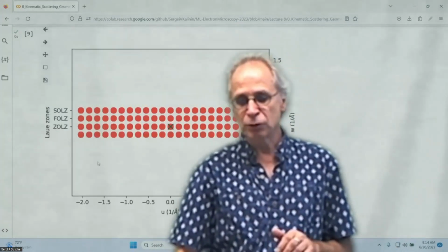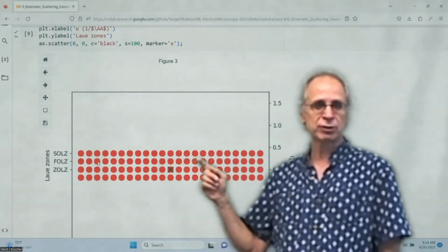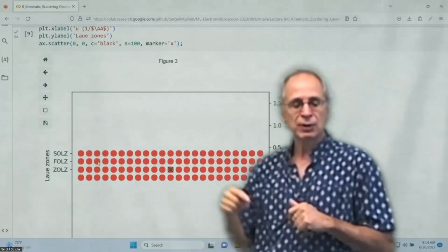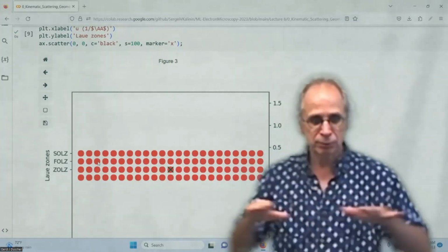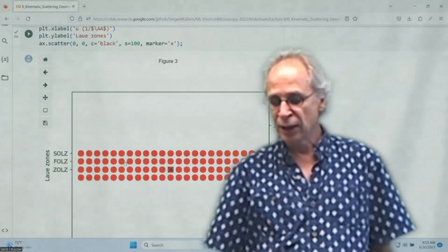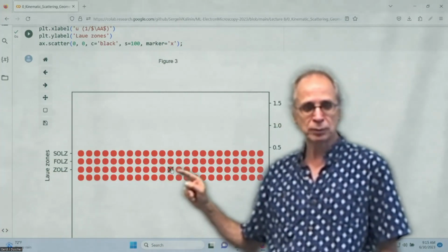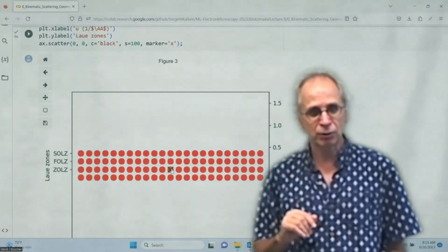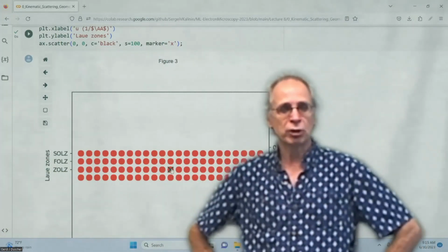Now we have to come to a few definitions that we're going to need. This is how we normally do a projection in reciprocal space. We don't need really a lot of atoms in the direction of the electron beam, but we need a lot of them in the plane. But it's in all 3 directions, okay? We'll visualize it in a moment. We define 1 point as the origin and 1 plane, the plane perpendicular to the incoming beam, that is the zero order Laue zone.